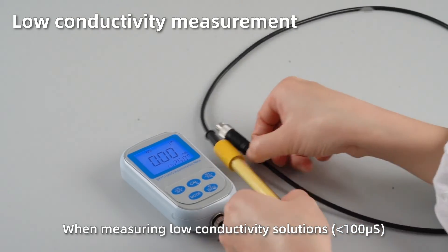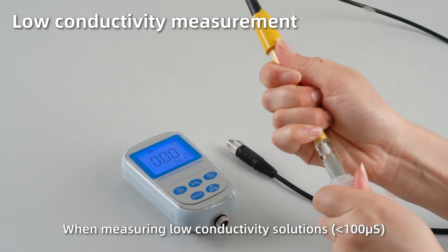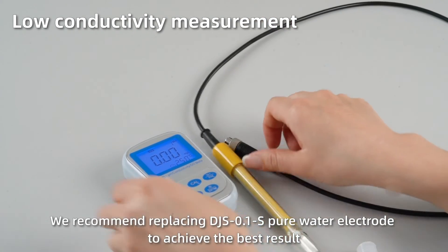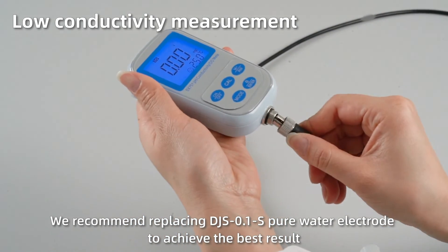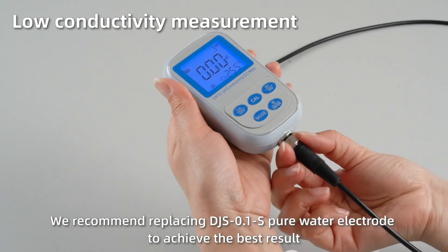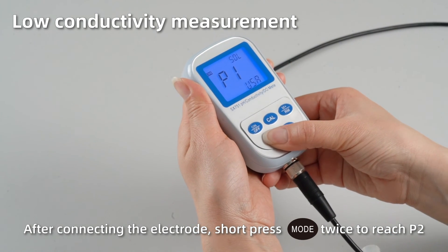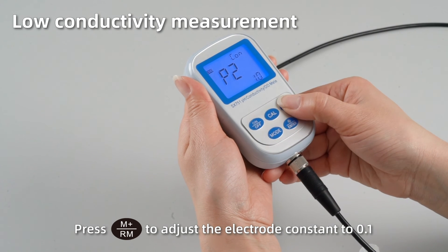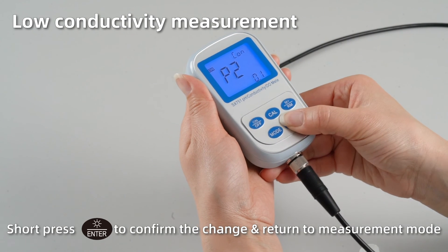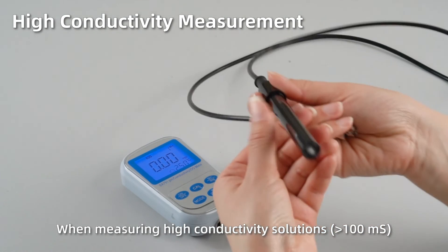Low conductivity measurement. When measuring low conductivity solutions, we recommend using the DJS-1S pure water electrode to achieve the best result. After connecting the electrode, short press mode twice to reach P2. Press M plus to adjust the electrode constant K to 0.1. Short press enter to confirm the change and return to measurement mode.